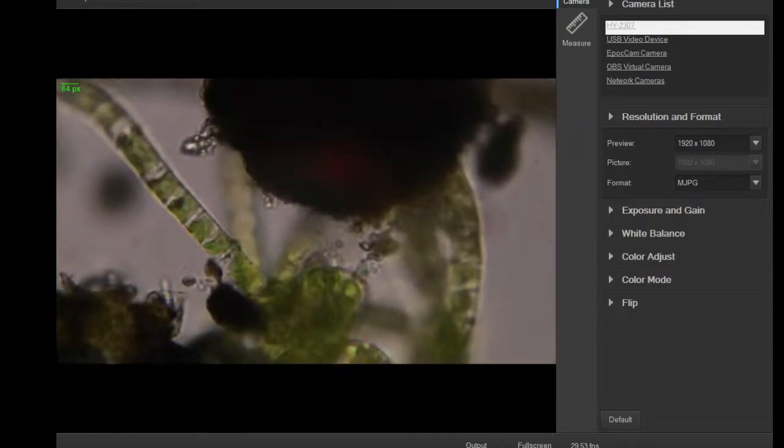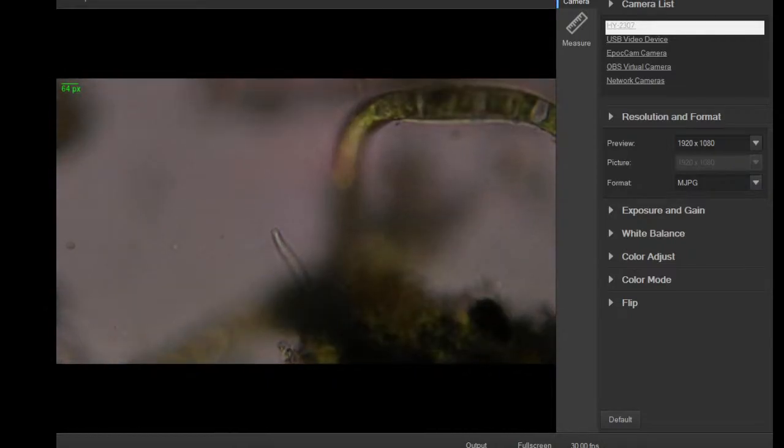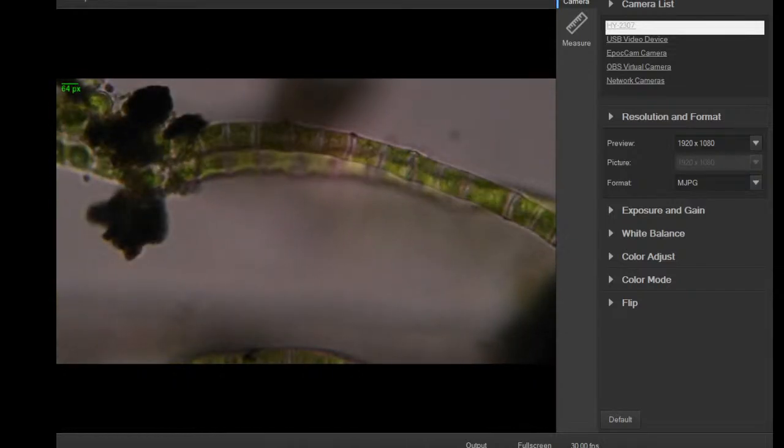You can see one of my older videos when I first started putting this channel together, paramecium. I got a really nice sample of paramecium from the zoo I used to work at. You can see them passing each other and pushing into each other, and they actually depress and flex, and they look stiff, but when they push on each other, they're actually quite soft. But you can also see where they don't quite touch exactly, because the cilia basically keep them from touching membranes directly, because they're all totally covered with cilia. So it's almost like they're gliding past each other, and you can't quite see why.